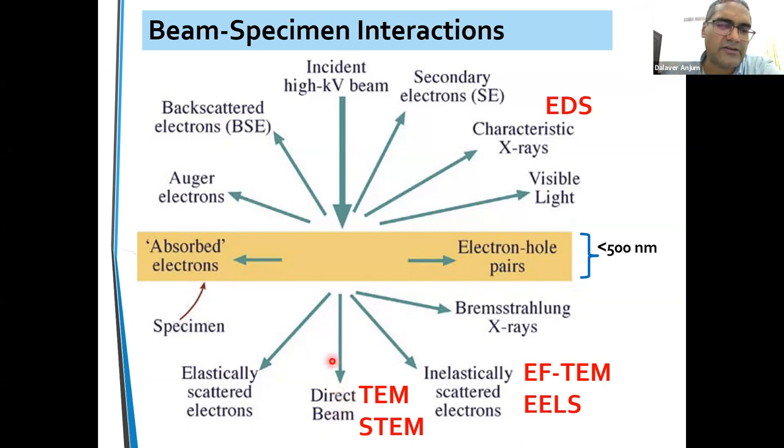So those are these electrons, and some basically take turns, but they don't hit the tree. And those are called elastically scattered electrons. And some will hit either your clothes, get some thorns, or break some leaves of the trees, branches. So that's called inelastically scattered electrons. And there are many other things.